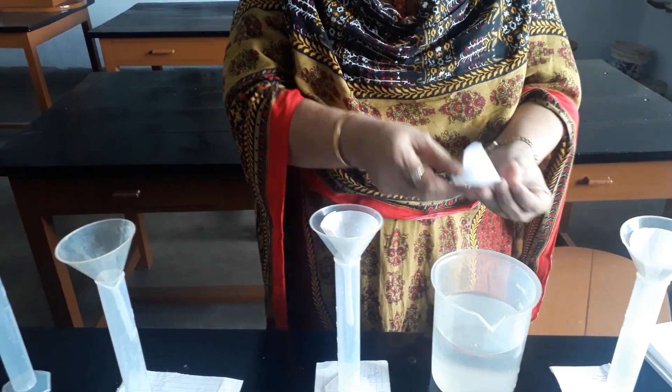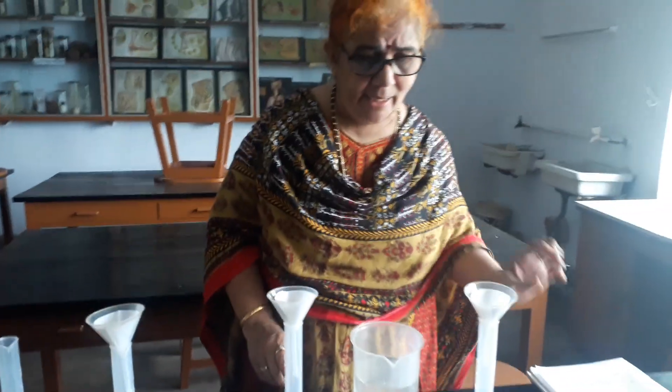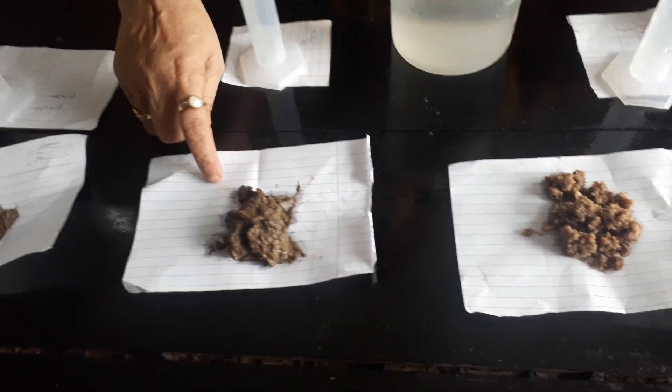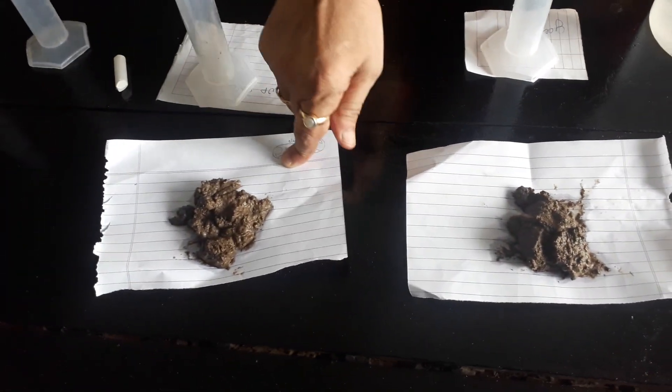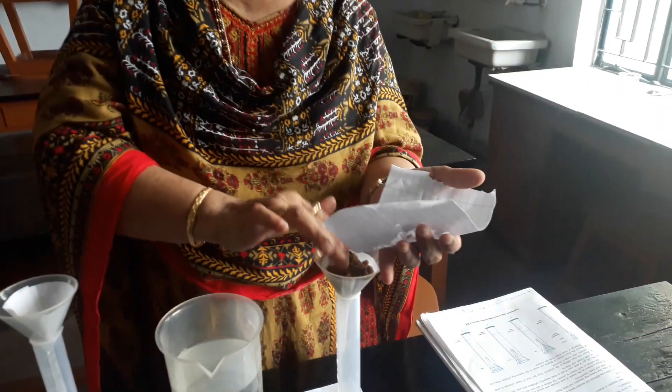Either directly wet or slightly make it wet. Already I measured and kept: this is 50 grams of sand, this is 50 grams of silt, and this is 50 grams of clay. Now I am pouring and keeping each soil sample in its respective funnel. Measuring is already done.